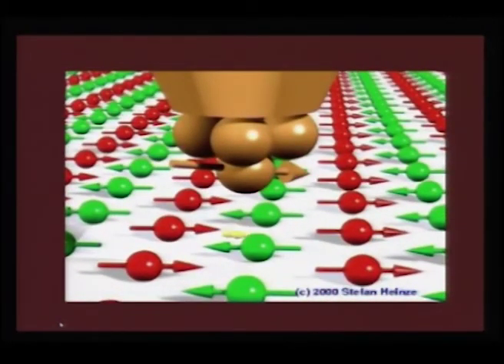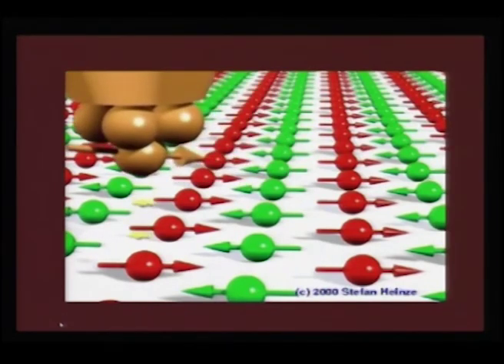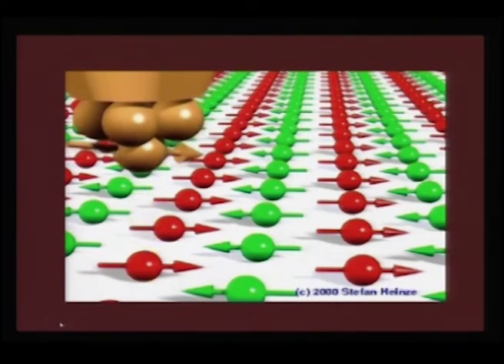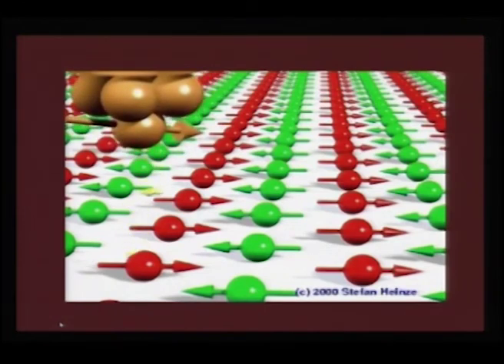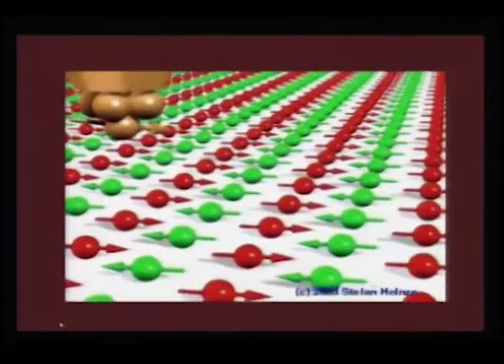It is not just a metal, but it is a magnetic tip, and this will keep sending the conduction electrons to the surface, and the surface here is nothing but a manganese antiferromagnetic surface, where every other manganese atom is antiferromagnetically arranged. So, the way the conduction electrons go from the magnetic tip to the atomic periodicity is different.